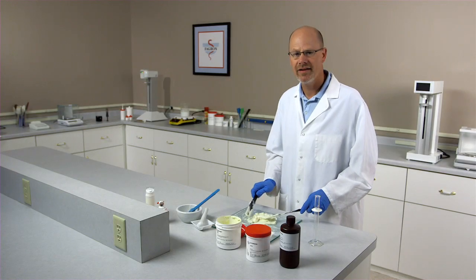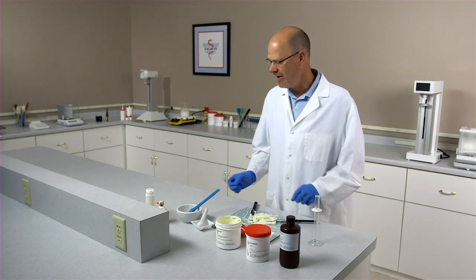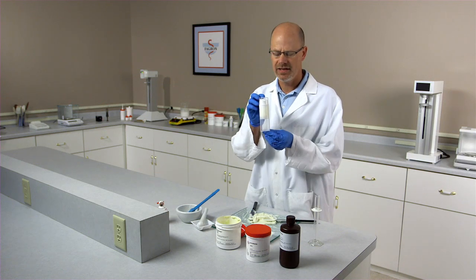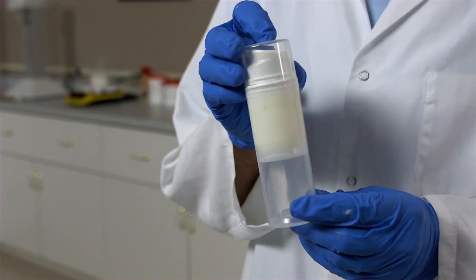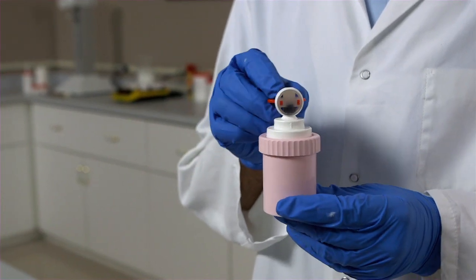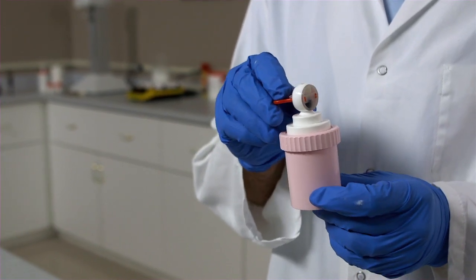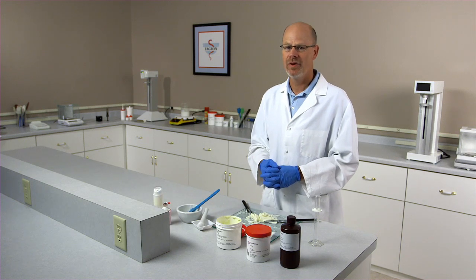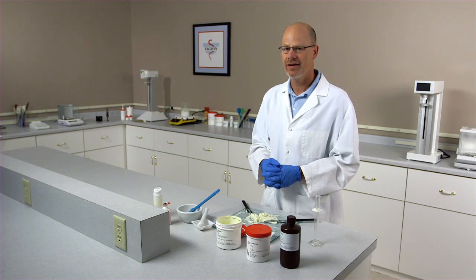Once you have an elegant preparation on your slab, you can now dispense the product. Choices for dispensing: you can use an airless pump, or you can use an ungawater jar with the exact dose dispenser. Visit the Fagron website to view the penetration enhancement study of Fagron's Pentravan versus PLO gel.